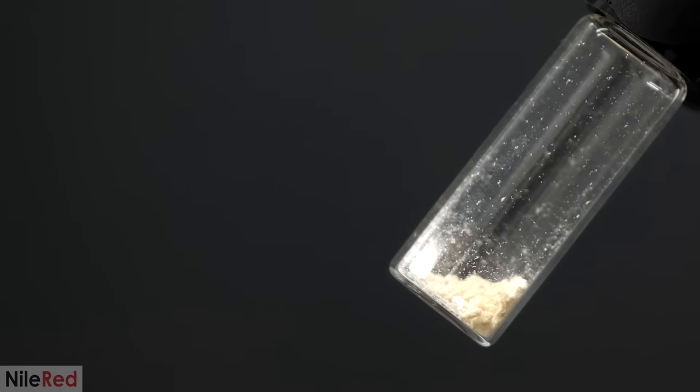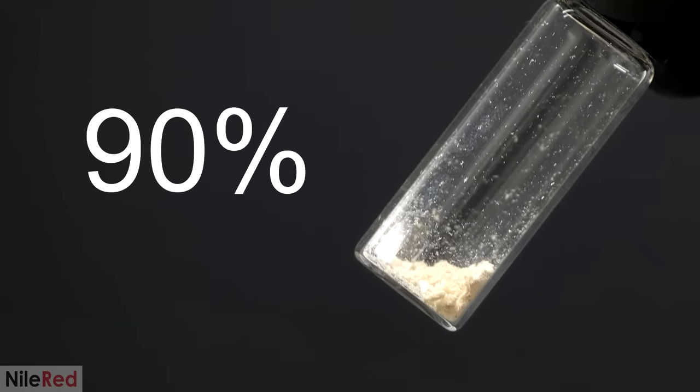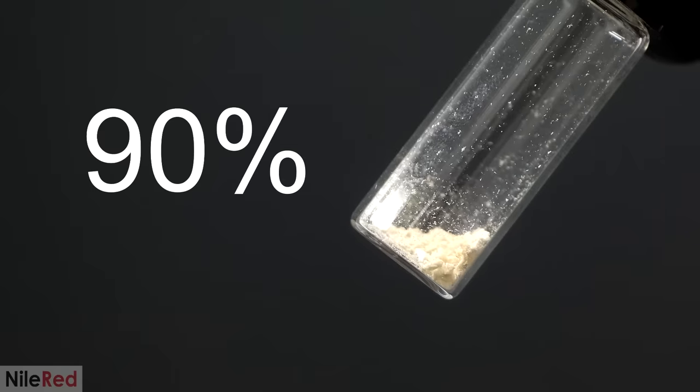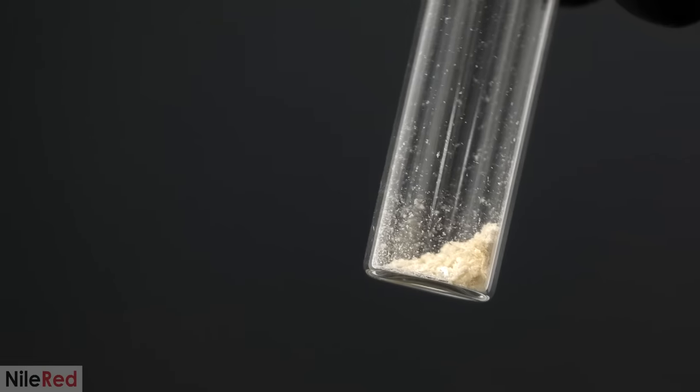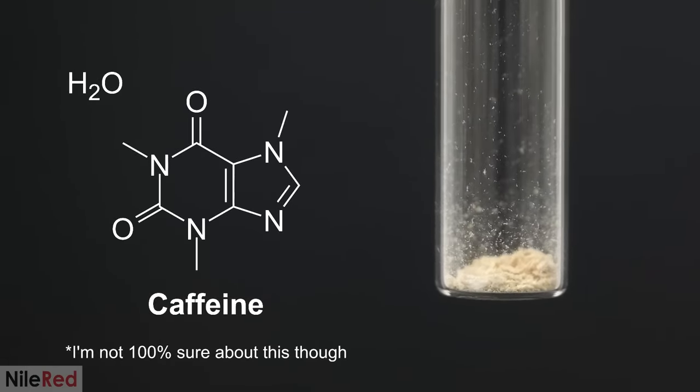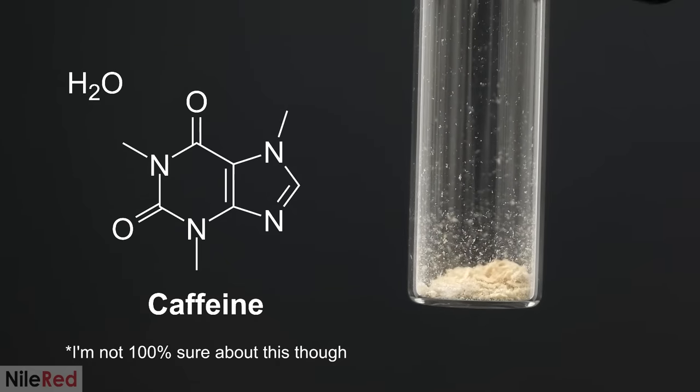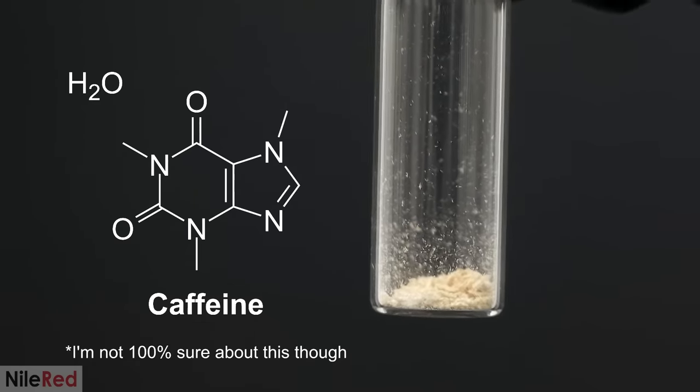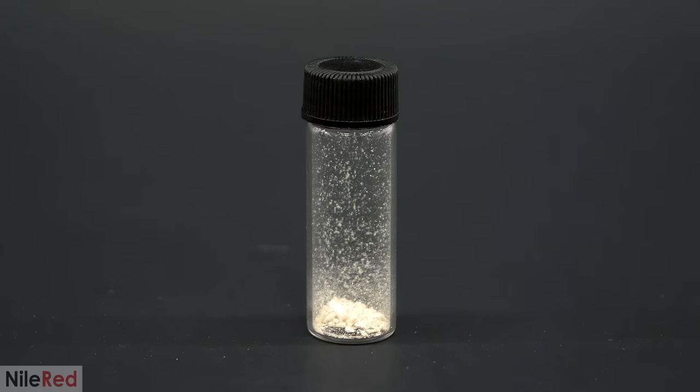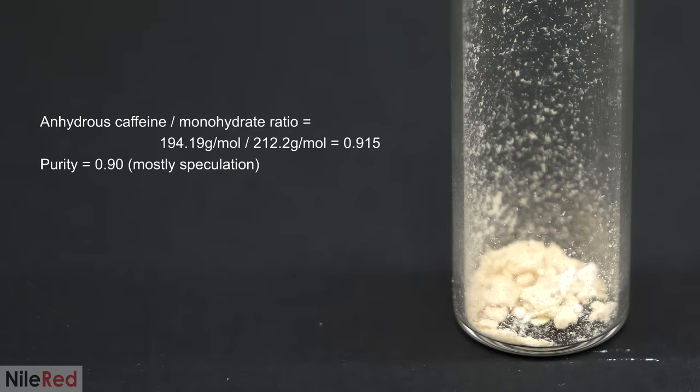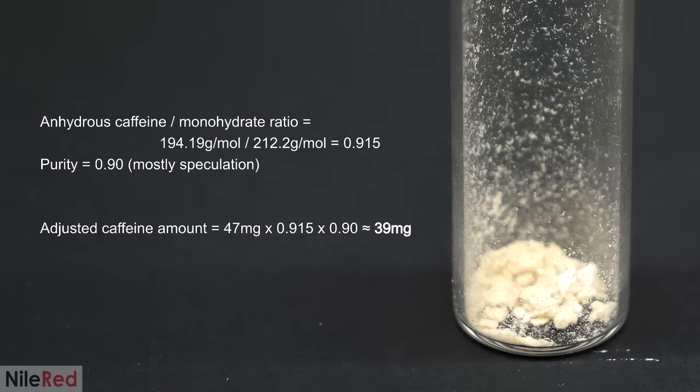However, it wasn't completely pure, and I felt that saying it was around 90% pure was probably a decent estimate. I think the caffeine that I had here was also in the hydrated form, which meant that each caffeine molecule was associated with a water. This would increase its weight a bit, and I felt that it was a good idea to adjust for that as well. So between that and the purity, I felt that I probably had more like 39mg of caffeine. This meant that I had taken out even less than I originally thought, and the Red Bull was probably more like 24% reduced.